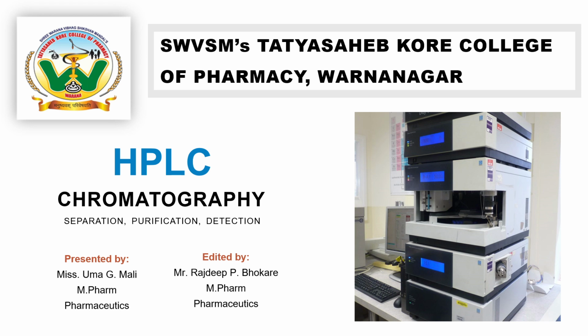Today we are going to discuss HPLC. The topic will cover the introduction, mechanism, working principle and applications of high performance liquid chromatography. HPLC is an abbreviation for high performance liquid chromatography. Chromatography is a technique for separation. A chromatogram is the result of chromatography, and a chromatograph is the instrument used to conduct the chromatography.